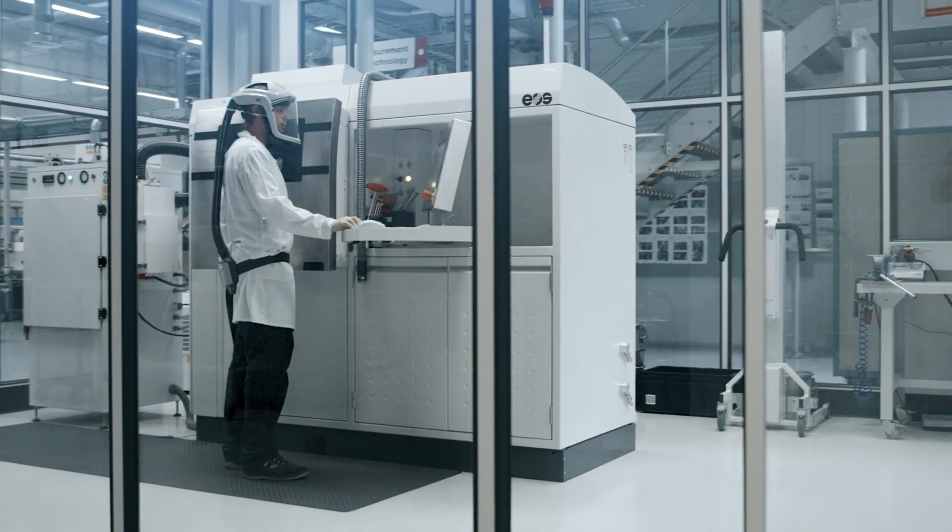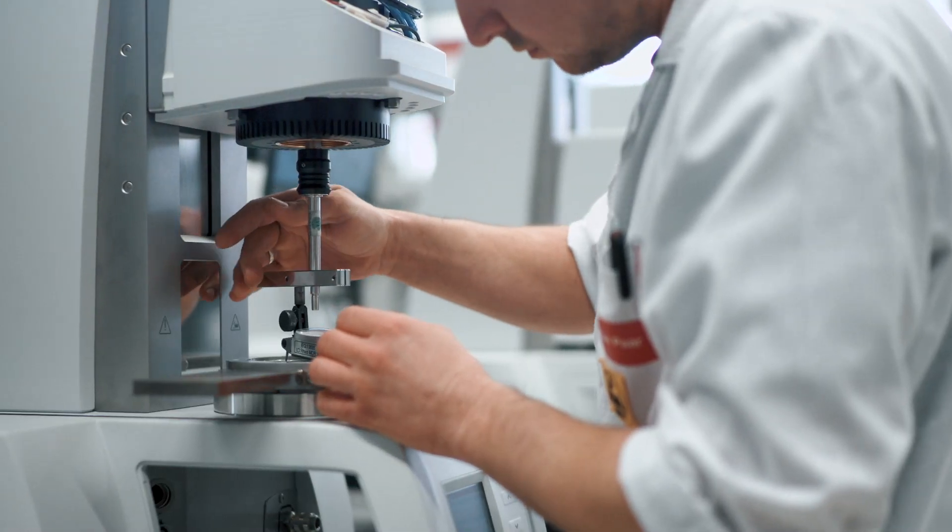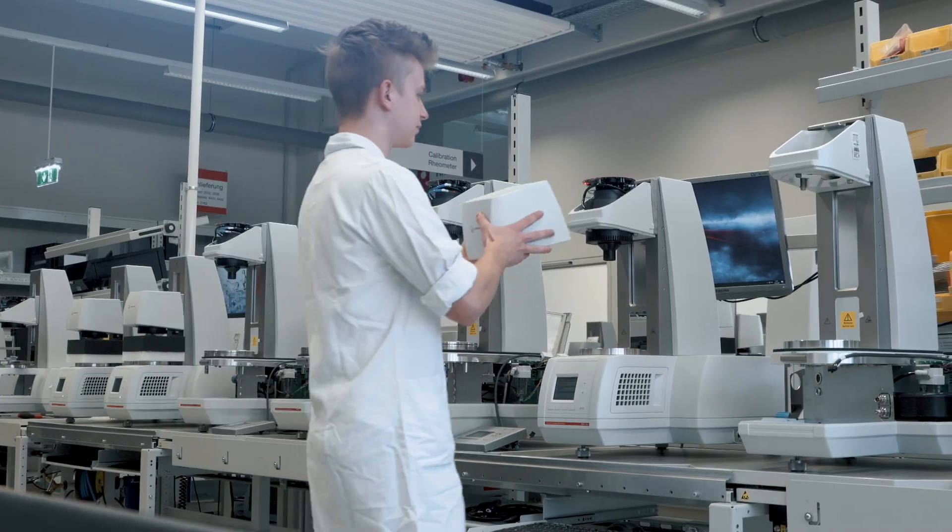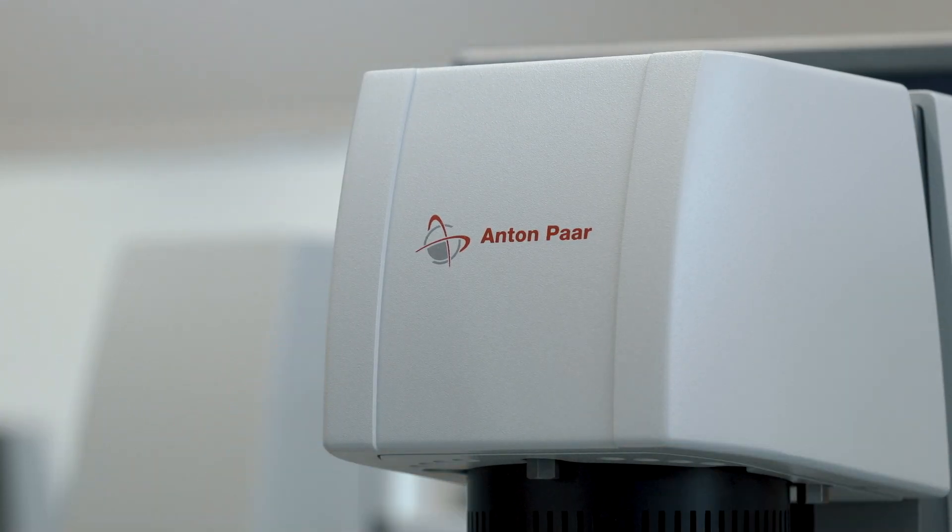Evolution is a process where small continuous improvements lead to a superior product. MCR was already the best. All the Evolution series means is the best just got better again.